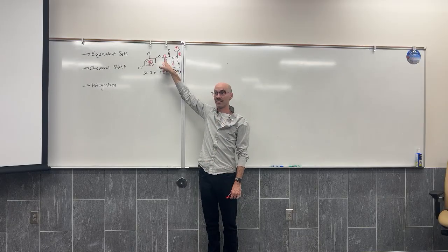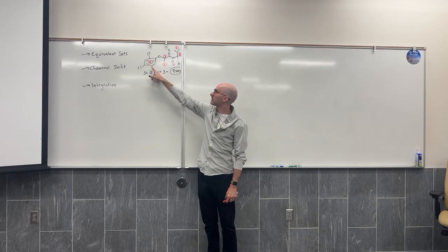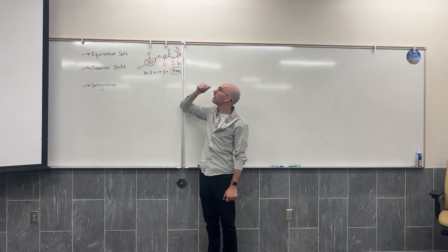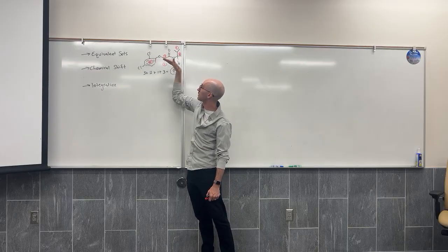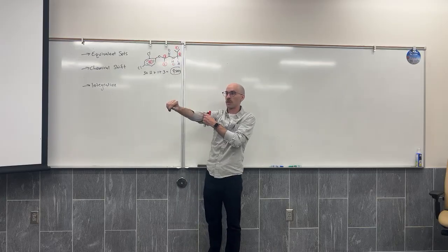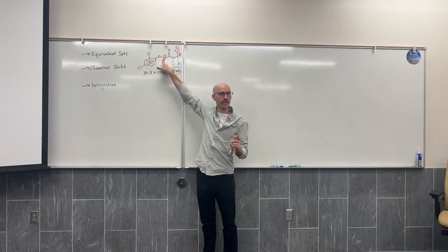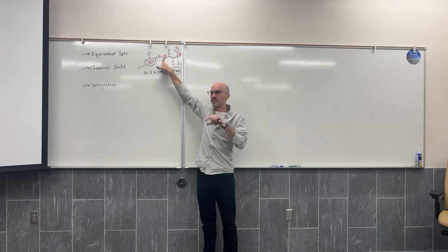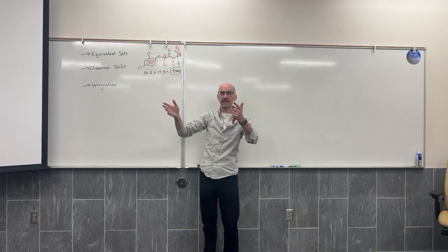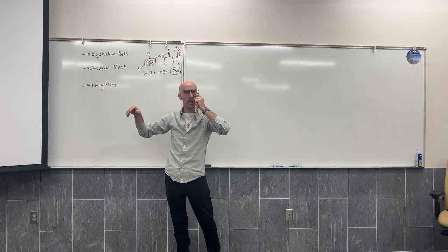Yeah, is that because it's sandwiched in there with all of the density from these guys? No, because it's losing a lot of density. It has an electronegative atom there and an electronegative atom there. But that makes it more shielded, right? No, it's exactly where we expected it to be from the correlation table. We said it's functional group adjacent twice, so we expect it to be on the far end of functional group adjacent, furthest to the left.